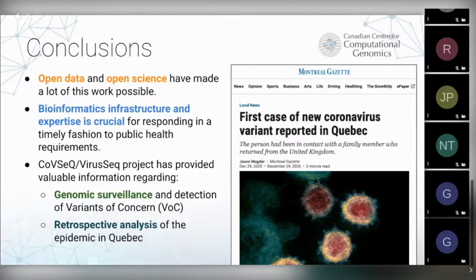I think you could. Honestly, the easier solution would be to sequence the virus without doing amplification, using long reads, kind of like with nanopore. I think that would be much easier than going the 10x route. But we're not currently doing that, because you really have to have a big viral load for that to work. Finding that kind of sample is difficult, and preparing it, and the focus is really on getting real-time results. So that's not currently within the scope.